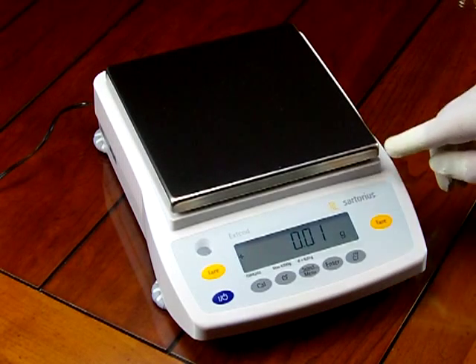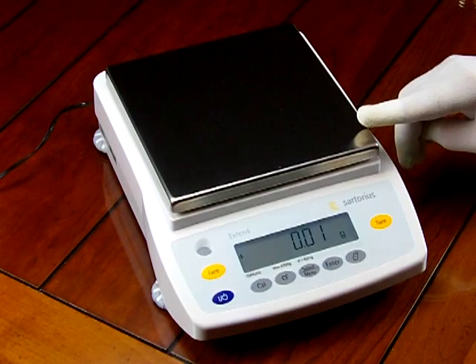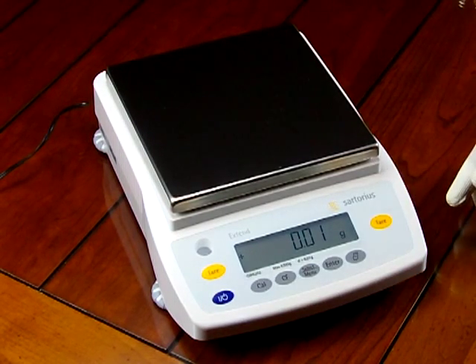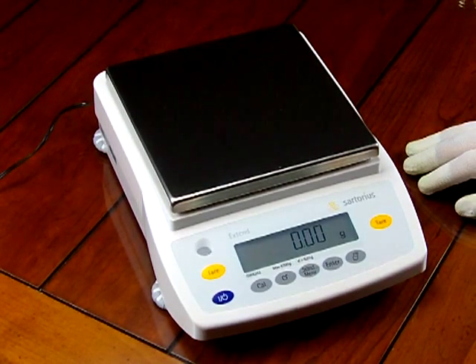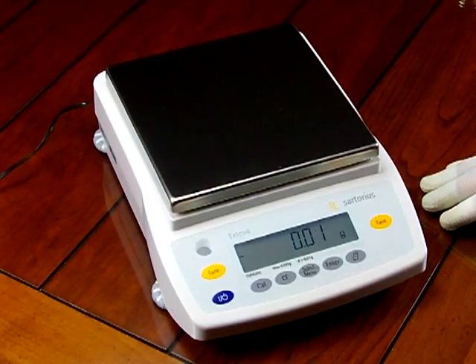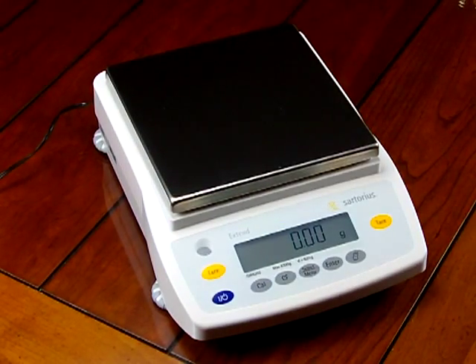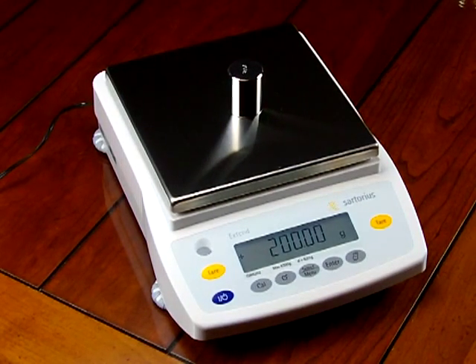Having a windshield is also a disadvantage — if you're weighing a large object that extends over the side, it could touch the windshield and interfere with the actual weight reading. And if you ever have a spill, the windshield would contain liquid on the balance. Sartorius is the premier manufacturer — just a clean weighing platform, because they know how to build a balance and deliver spectacular weighing results.